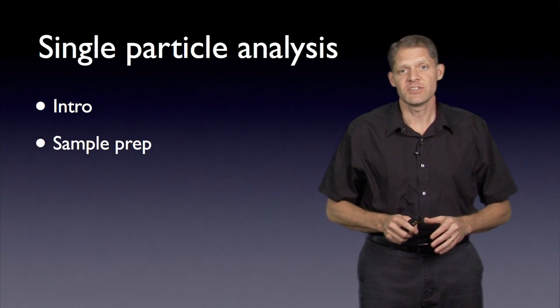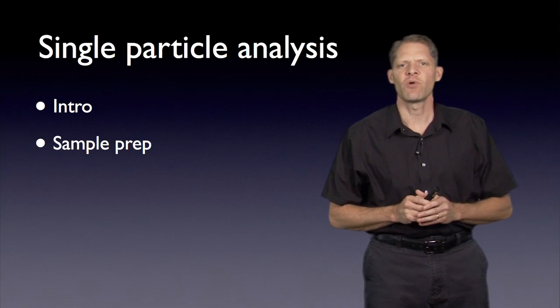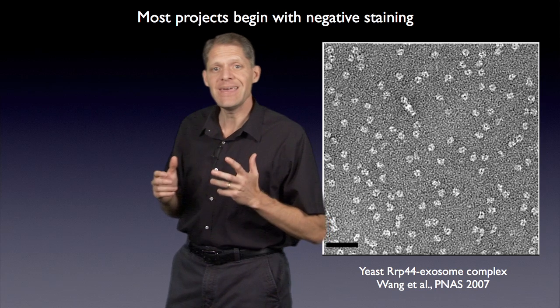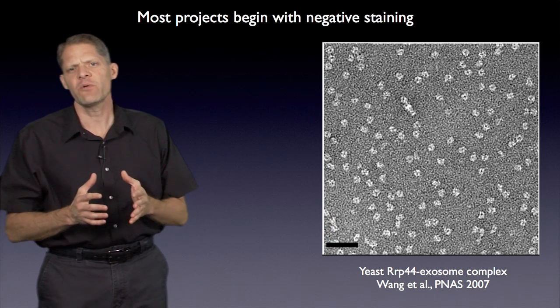So with that introduction to single particle analysis, now we're going to talk about some of the special issues that arise in sample preparation for this technique. Most single particle analysis projects begin with negative staining. We covered this earlier, but just a quick review.